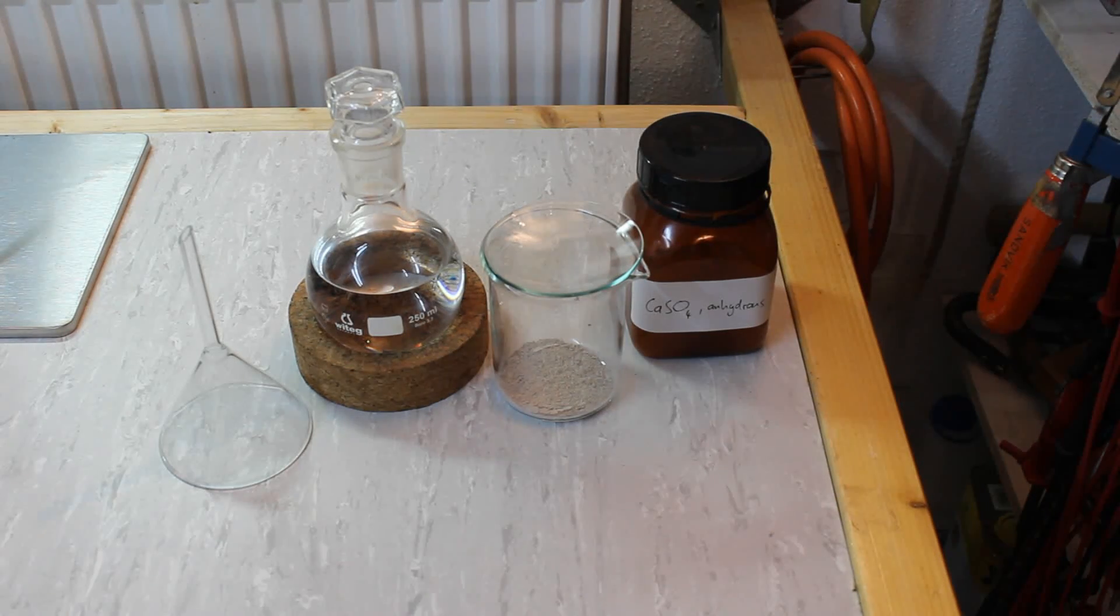So since we have roughly 250 milliliters of acetone here, we need 6.25 grams of anhydrous calcium sulfate. But to compensate for any impurities or water that might already be present in the calcium sulfate I have, I measured out 7 grams.